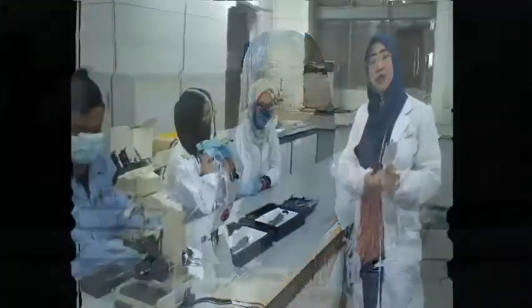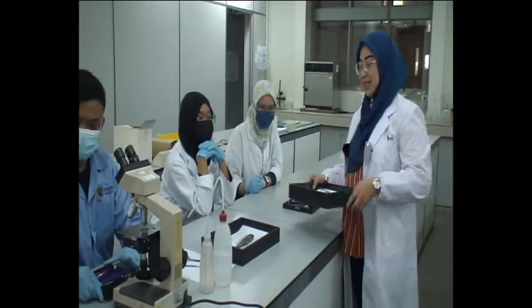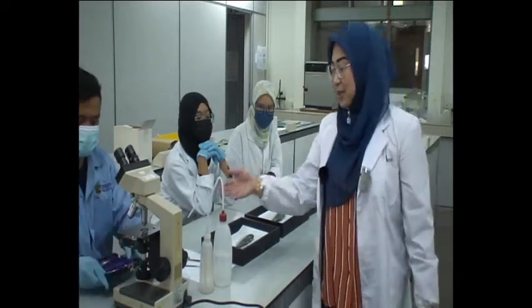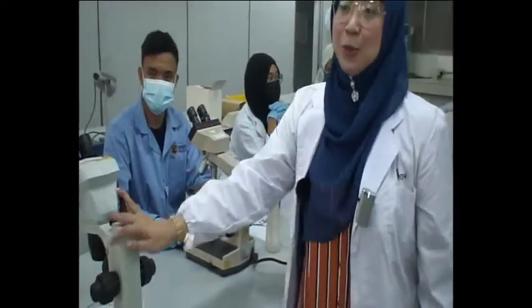For the materials that we are going to use for today's practical, the first one we have is bony fish, which is selar kuning. We also have the dissecting set, the distilled water, scissors, the compound microscope and the dissecting microscope.